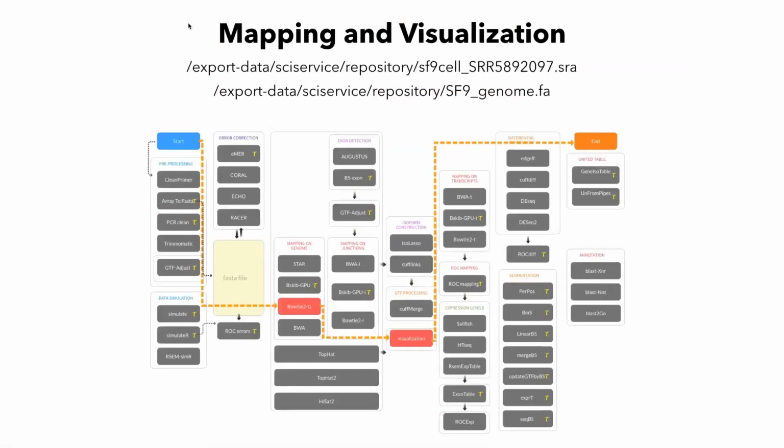The first pipeline that we want to prepare today is going to deal with mapping the raw reads, the FASTQ files, onto a reference genome. So again, just like I was showing, we have an SRA file. So this is a file downloaded from NCBI, and SRA, all it does is it compresses the raw FASTQ file.